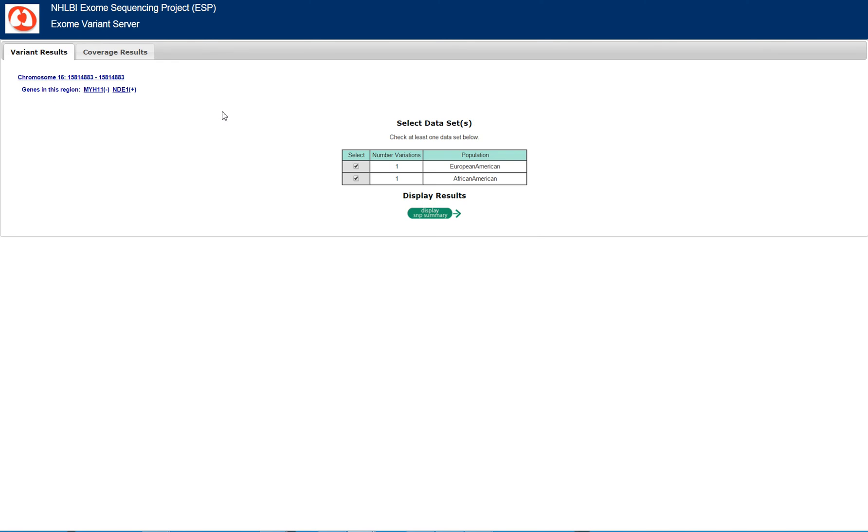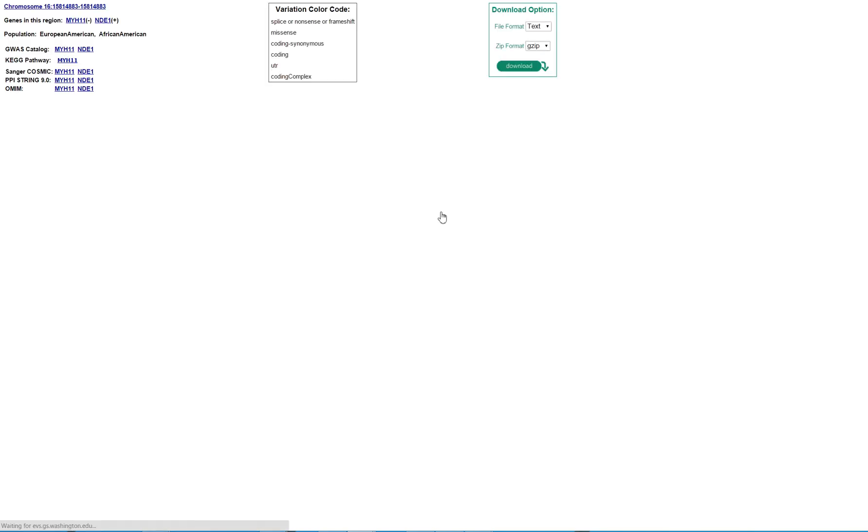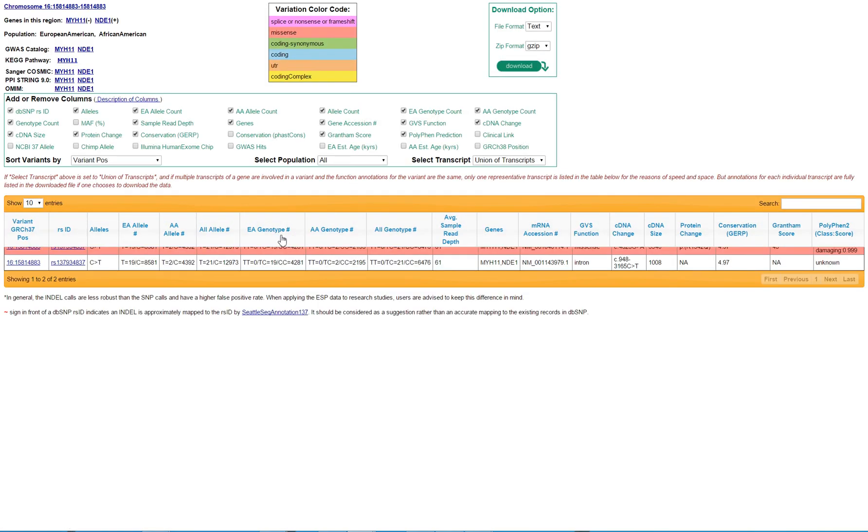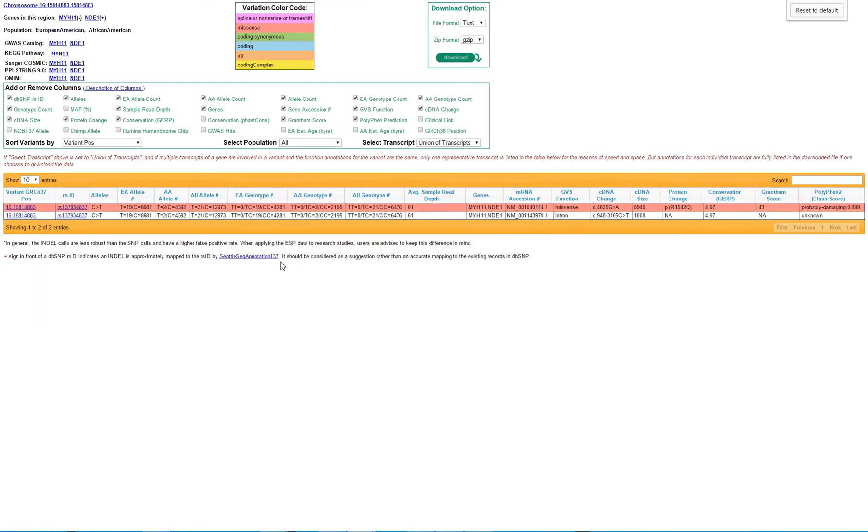You can choose the data you would like to review. I want to look at both European and African American data. This is a little bit squished, so I zoomed out there for a second. You're able to see how frequently this variant is present in the Exome Variant Server, or ESP, Exome Sequencing Project.